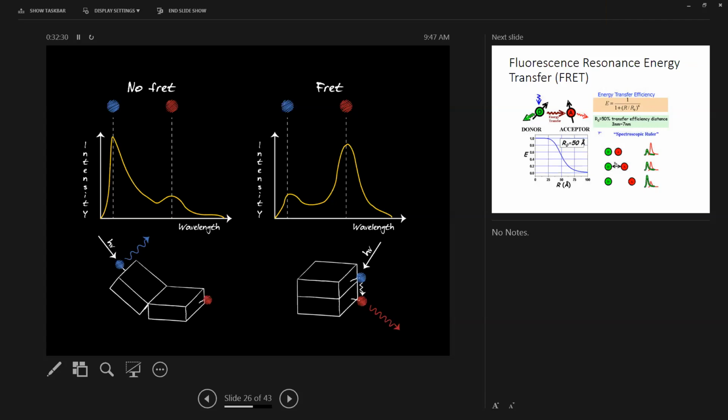Liang? Yes. Is it correct to assume that the area under this graph would be like the total energy going on inside this transition, or is that not correct? I think you can say that. But you need to make sure there's no other energy release. You need to make sure there's just pure energy transfer. There's no other side effect from these kinds of reactions. Definitely, the area will be the same for both.